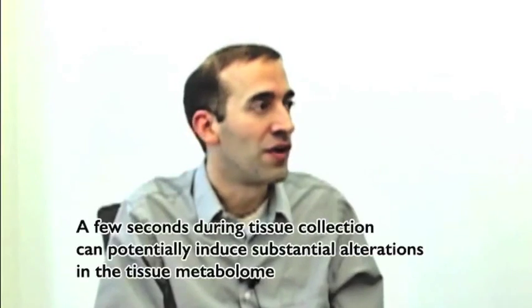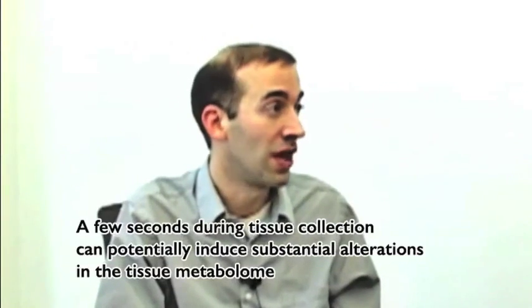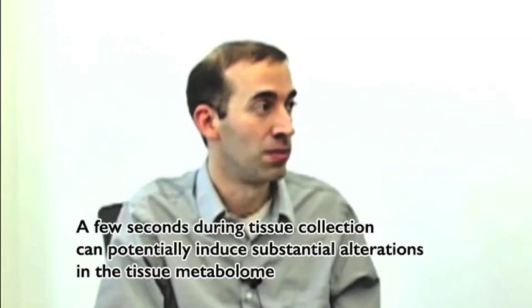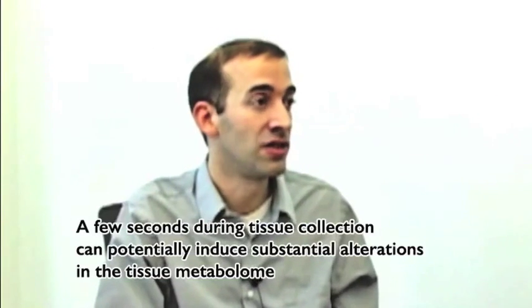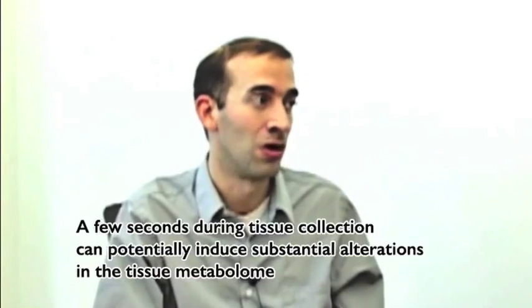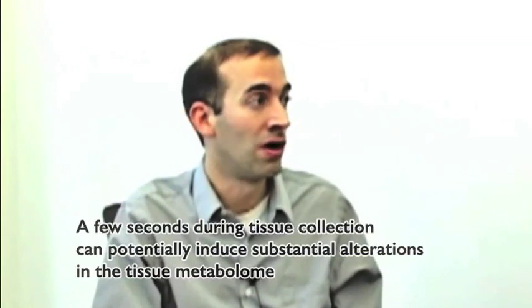What are some of the most important considerations for tissue collection for metabolomics in animals, like rats and mice? Sure. So the metabolome is an incredibly dynamic entity. Just a few seconds of alteration caused by something that you might do to collect tissues, like performing surgery or a cessation of blood flow, is enough to potentially induce very substantial alterations in the tissue metabolome. So these are things we need to be aware of in a tissue metabolomics experiment.